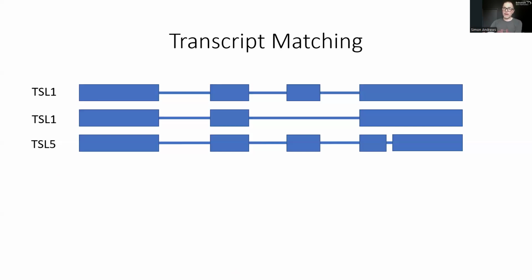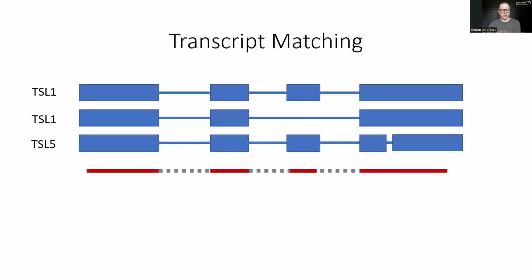We're going to look at the mapping of reads to the isoform structure. So if I put my first read out of the data up, this read looks like this. I said that we had some flexibility values. So when we're matching the aligned reads against the annotations, we have 2 types of flexibility. We have positions like this, where we have the end of an internal exon that may not match exactly against the spliced positions of the aligned read. So that will be the standard flex value. So we might say, well, you can have like 5 bases either way. So you've got to be close to that position, but you don't have to be exactly on it.